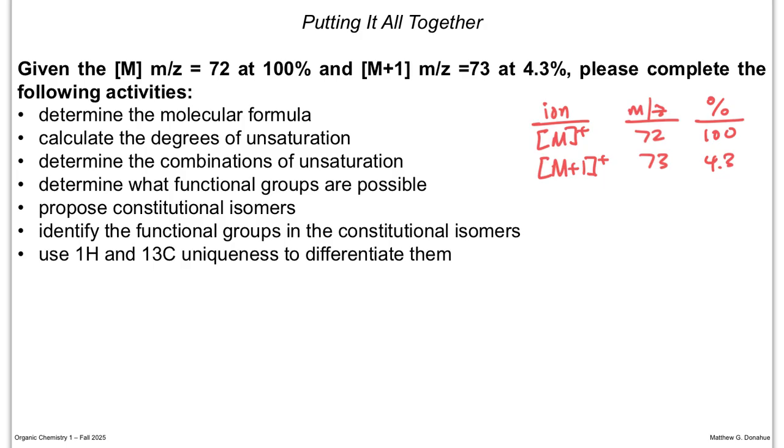So the next set of data we see here, we're gonna dial it back to simpler functional groups, but now notice there's no structure shown. You're just given mass data. So we want to go through this and start making some claims to structures that will fit this, and then that's going to lead us into the IR. So here's the information we're given that I just rewrote in a tabular form.